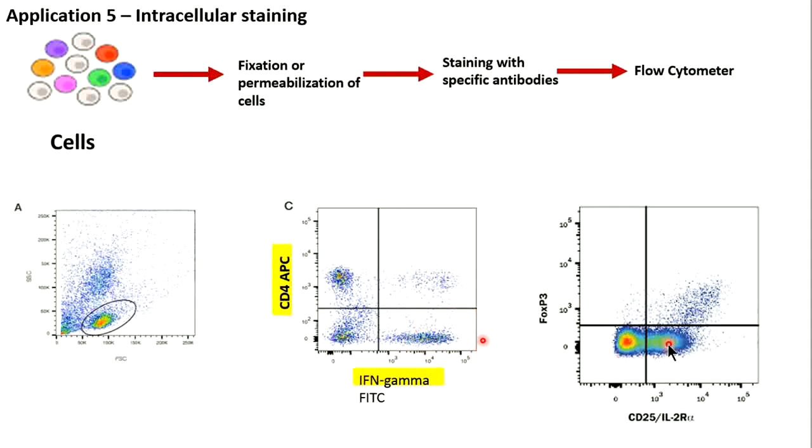So by flow cytometry, you can analyze the external proteins present on the surface, but you can also analyze the proteins which are present inside the cells by just fixing and permeabilizing the cells and sending your antibodies inside the cell. After that, it's just the simple measure of FSC, SSC and fluorescent intensity. Very simple. We are following one very basic principle.